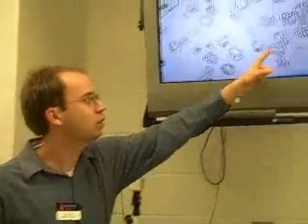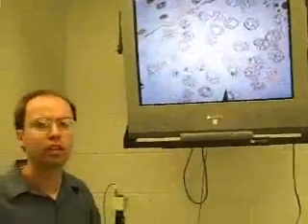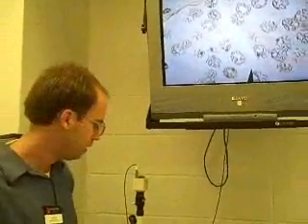Now, I am not going to go over with you all the details of meiosis. There's another video for that. Also, you should study in your lab manual for that. I'm just going to show you this picture of it. So, crossing over in prophase 1 of grasshopper testes.